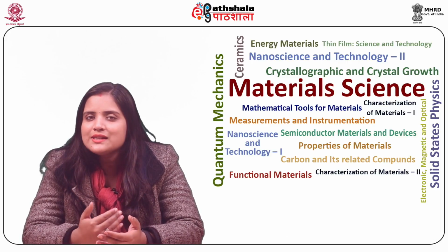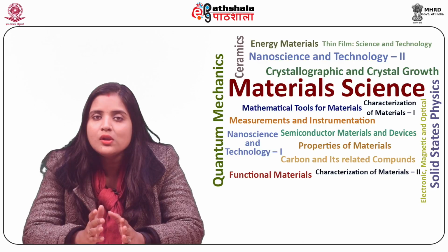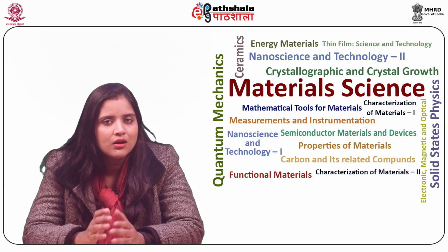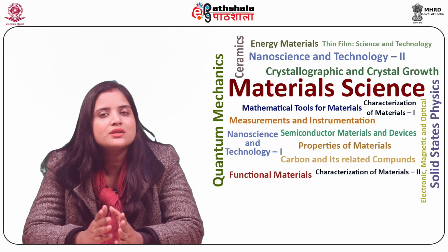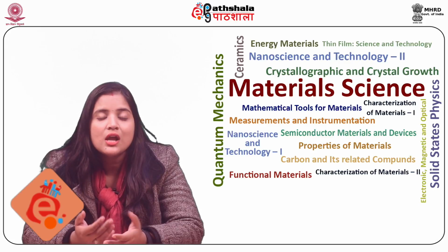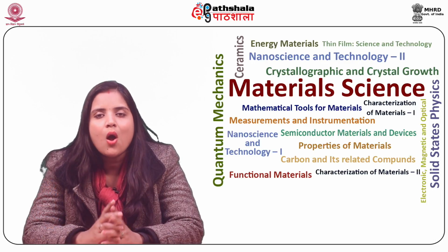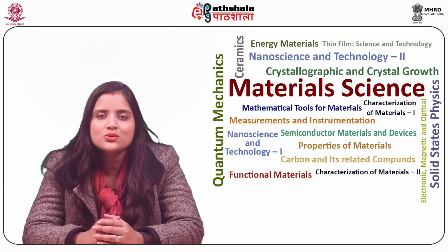So students, let us now summarize what we have learned in this module. In this module, the working principle of electron probe microanalyzer was described. Then, the instrumentation of electron probe microanalyzer was discussed in detail. Then, the sample collection, preparation, and data collection were also described. Finally, the limitations and strengths of electron probe microanalyzer were studied. Thank you, students, for your attention.